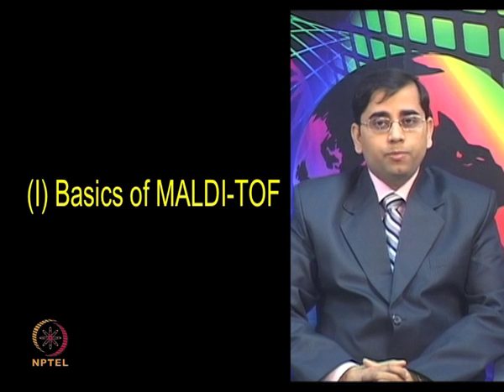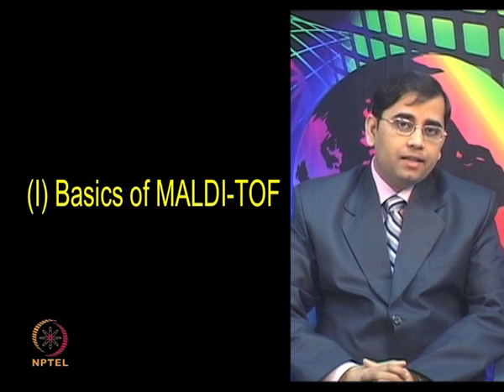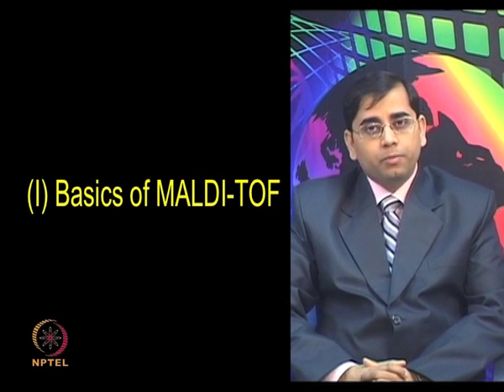So, MALDI is an efficient process for generating gas phase ions of peptides and proteins for mass spectrometric detection. MALDI is one of the most widely used ionization techniques currently applicable in the proteomics area. This ionization method was independently developed by two scientists, Koichi Tanaka and Franz Hillenkamp. Tanaka also received the Nobel Prize for his novel contribution to soft ionization techniques such as MALDI.